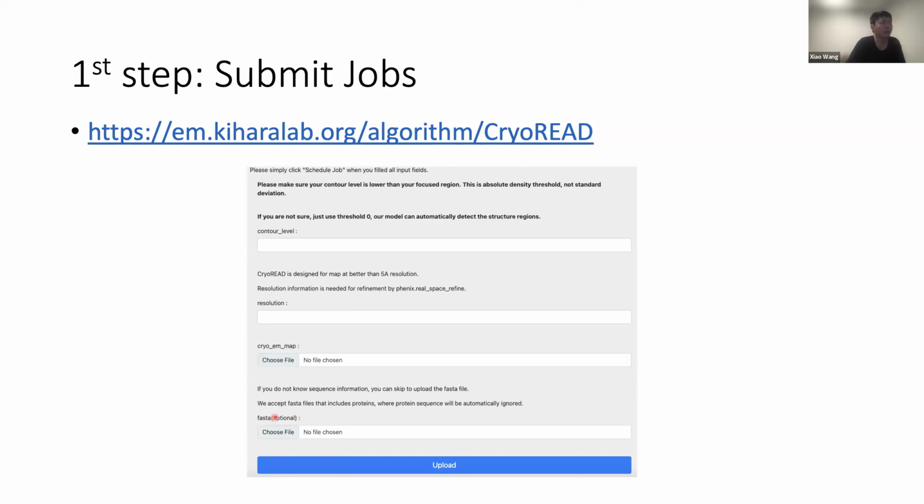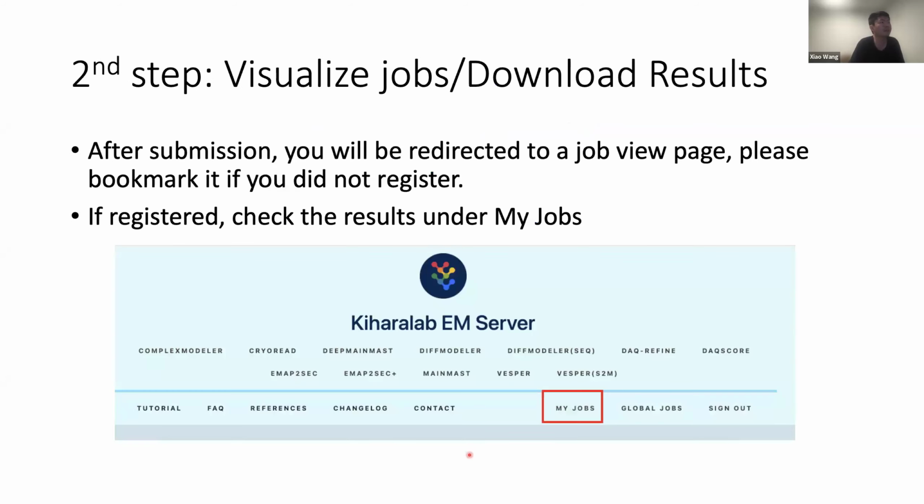And if you know the sequence information, you can provide the FASTA file here. If you are not sure, you can just skip it and upload. And after you upload your structures, you can see your results in My Jobs.